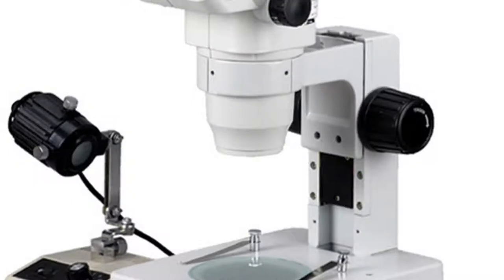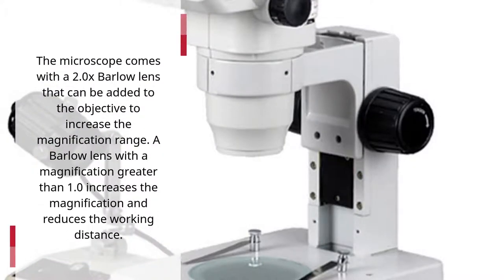The microscope comes with a 2.0x Barlow Lens that can be added to the objective to increase the magnification range. A Barlow Lens with a magnification greater than 1.0 increases the magnification and reduces the working distance.